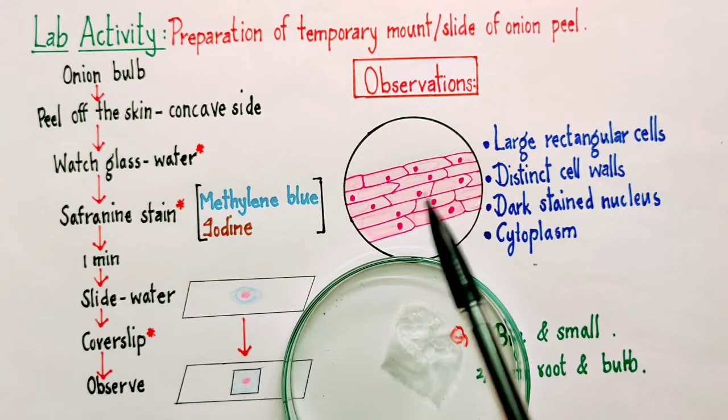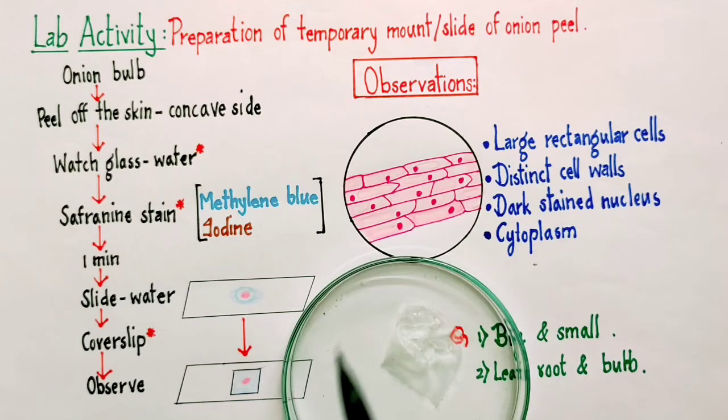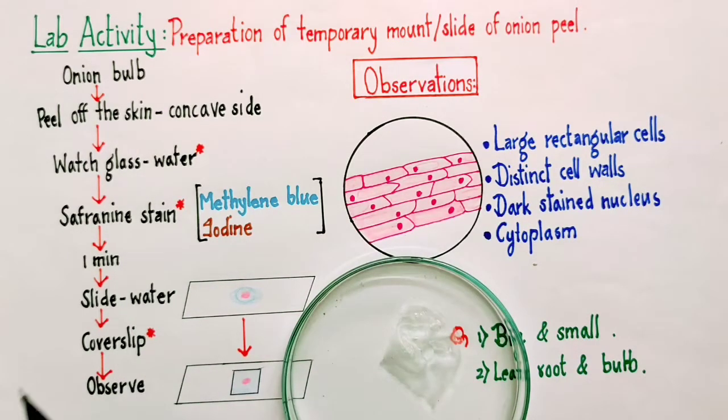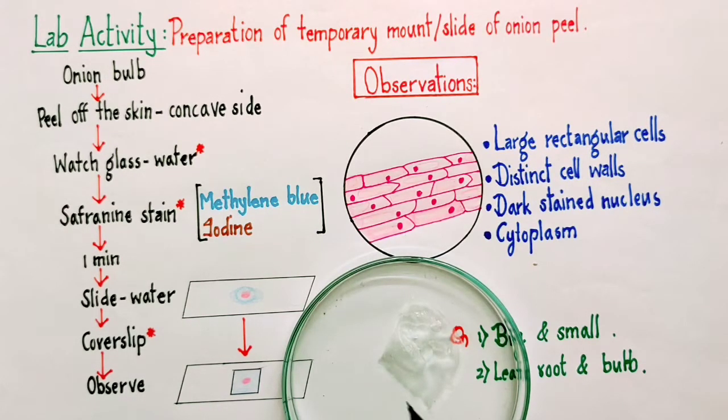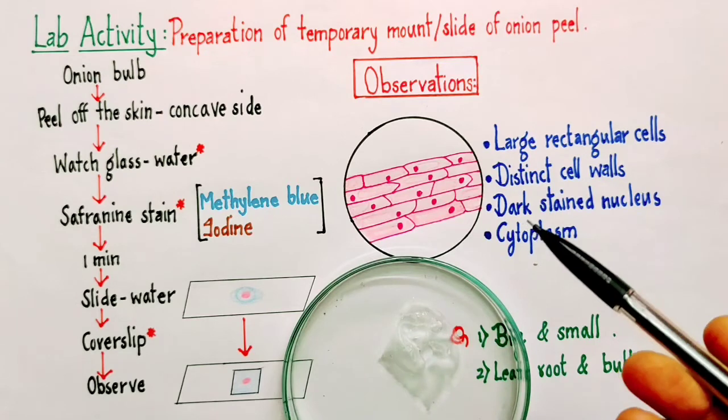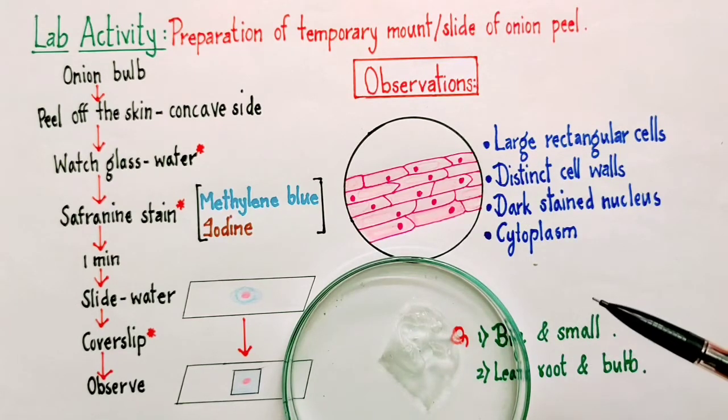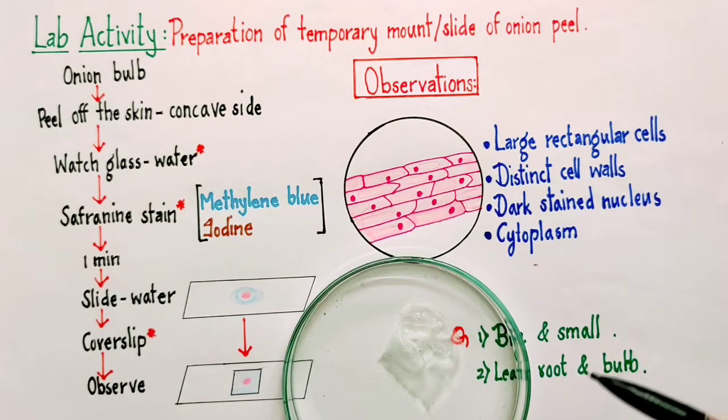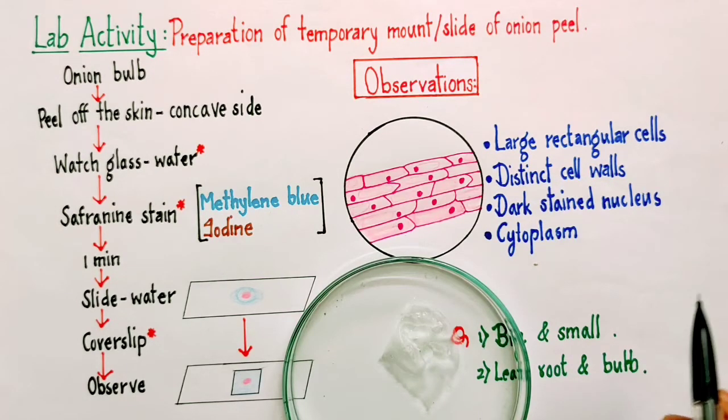We want to see the cells very clearly. We want to distinguish one part of the cell from another part. For that we need to add the stain. When we add the stain, the different parts of the cell absorb the stain by different extent depending upon their chemical composition.